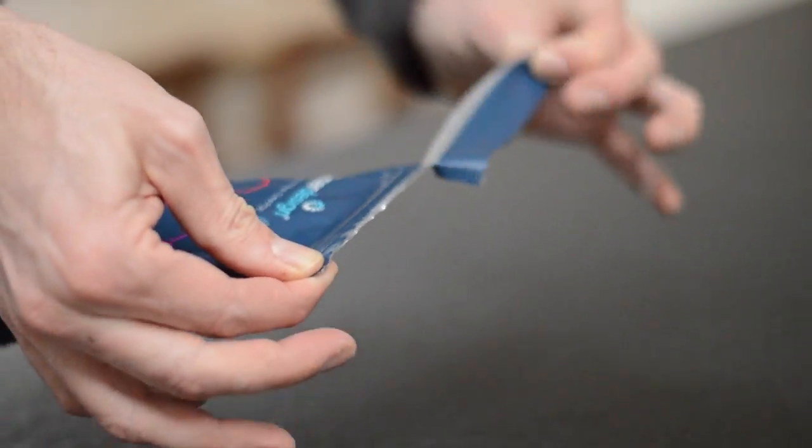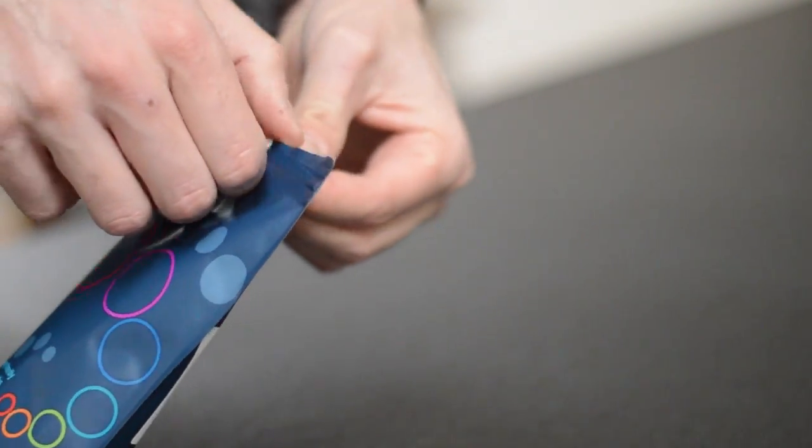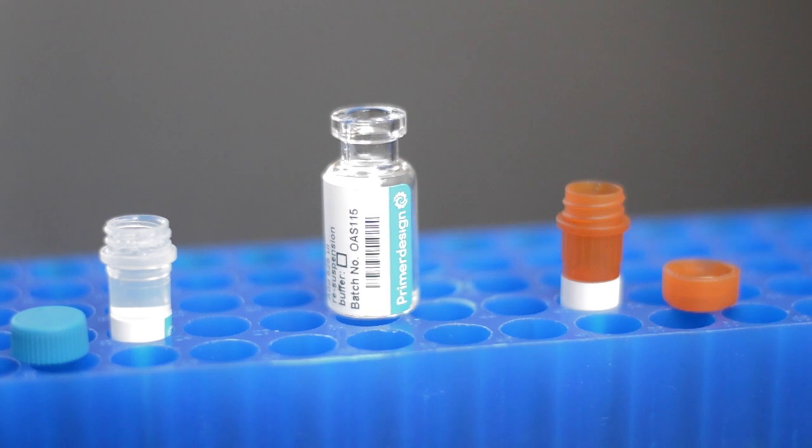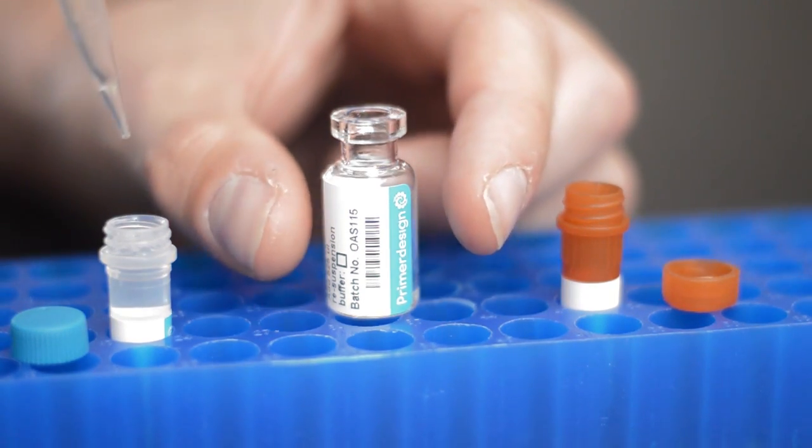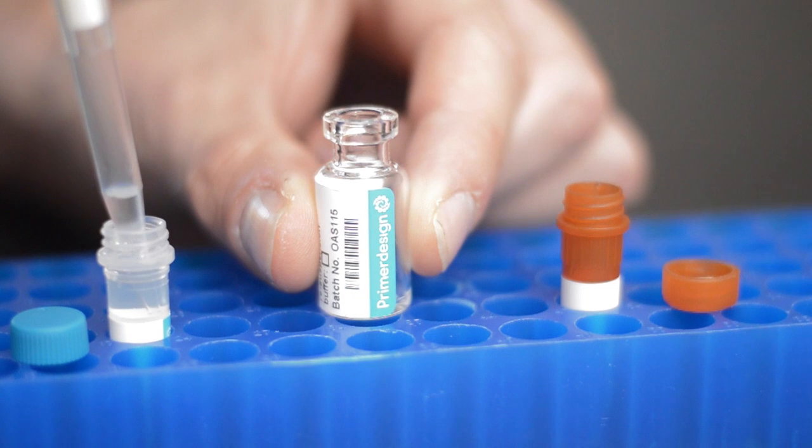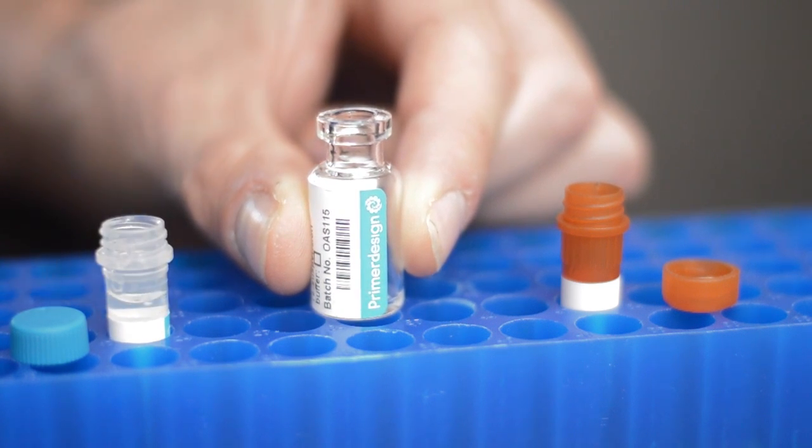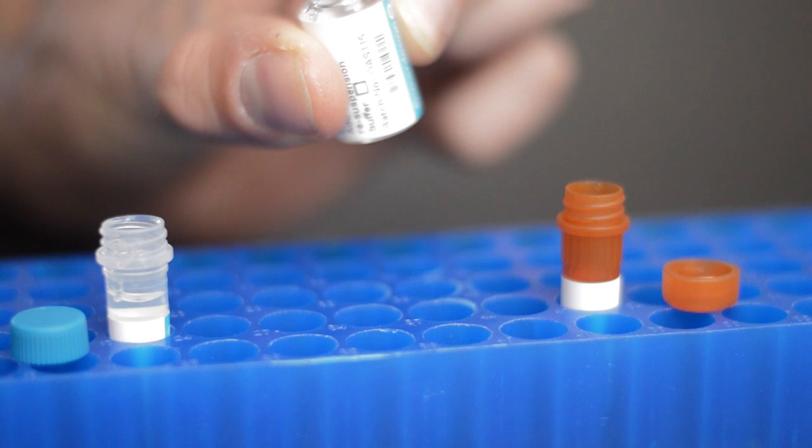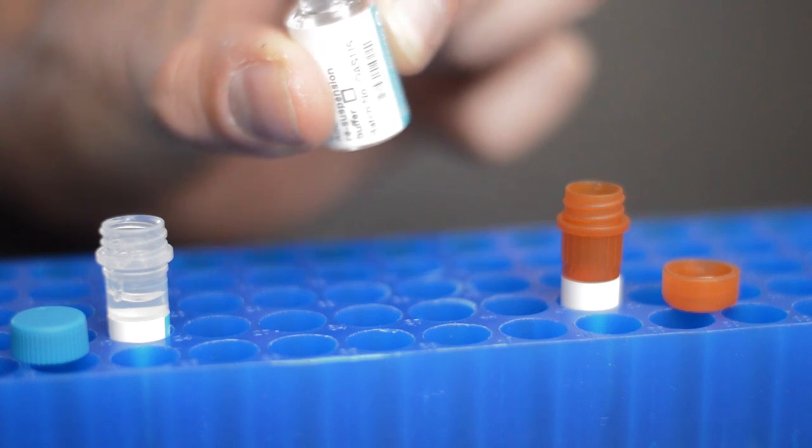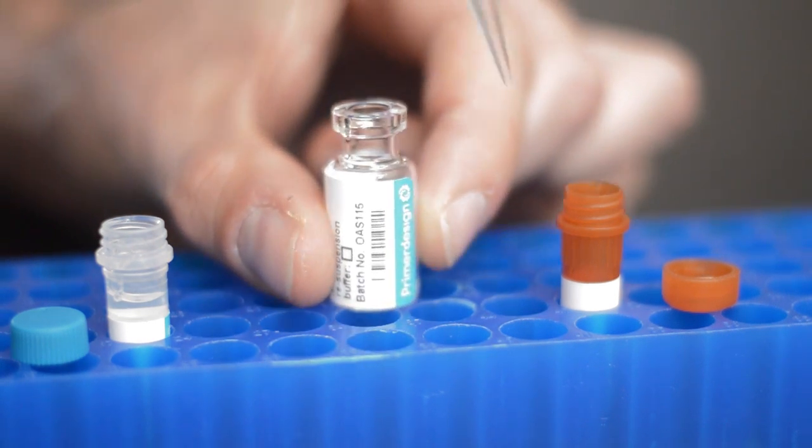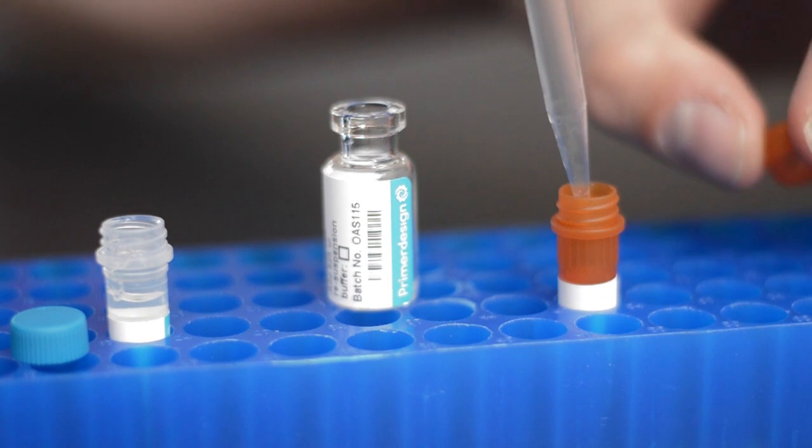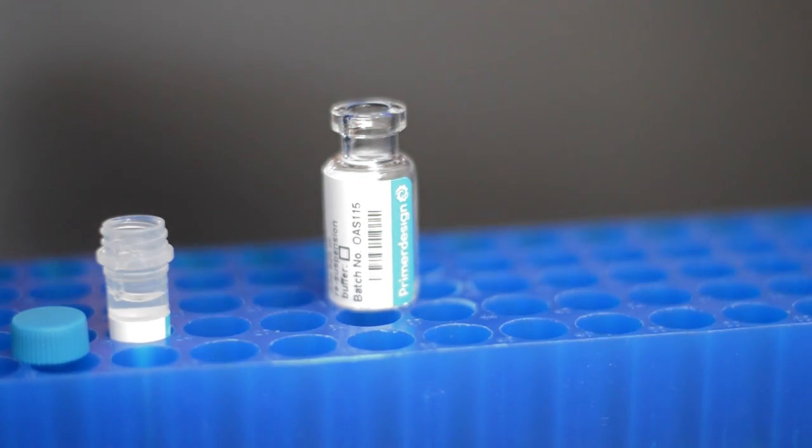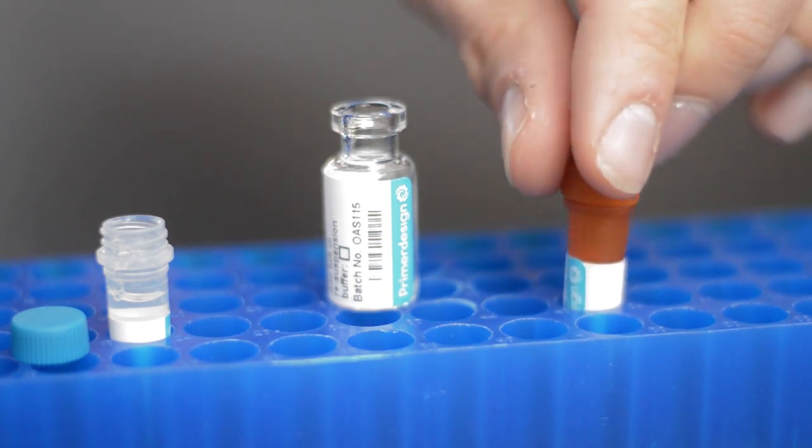Now it's time to open your Genesig Easy Kit. The first step is to make up your reaction mix. It's really easy. Add a small volume of the resuspension buffer to the OASIG master mix vial. Then transfer all of this into the tube labelled primers and probes. Give the tube a really good shake and leave it to stand for five minutes. This reaction mix is now ready to use.